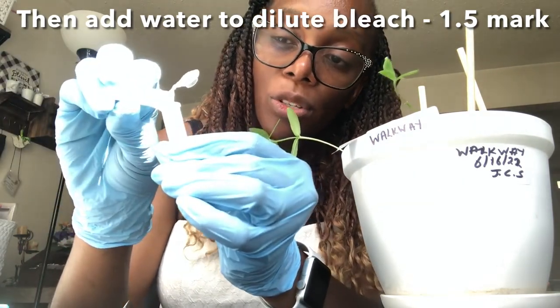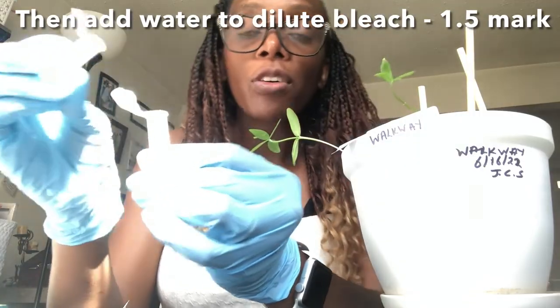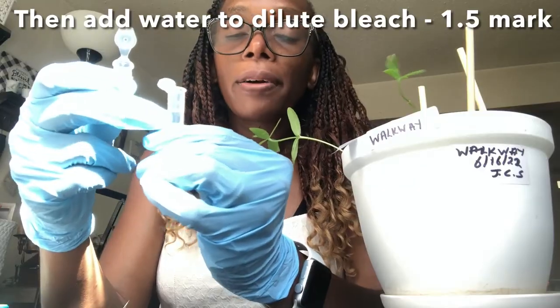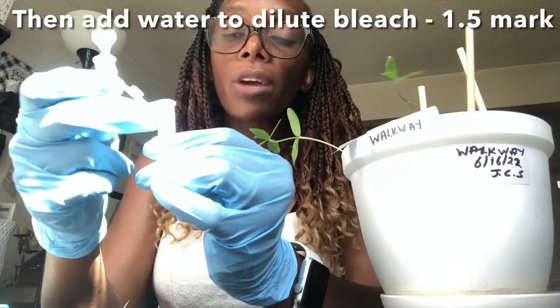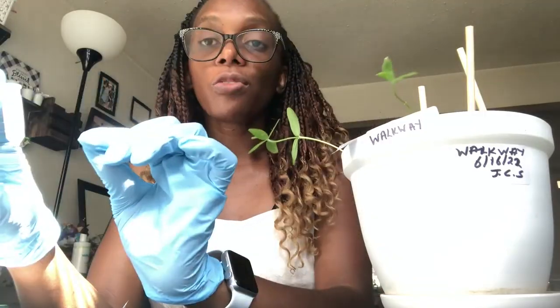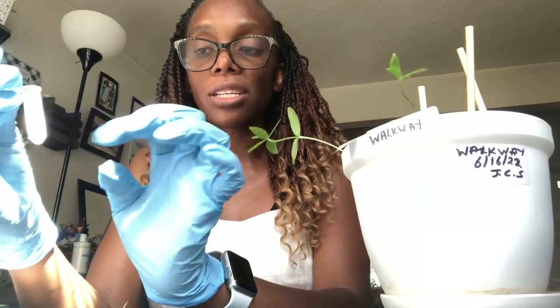Okay, so remember that everything that you do, however many drops you add, and the volume that you use, whether it is 1.0 ml or 1.5, depending on where the level was at, you have to indicate that in your eLab notebook. So if you're on the high concentration, add more water, and if you're more on the low concentration, you obviously add less water.